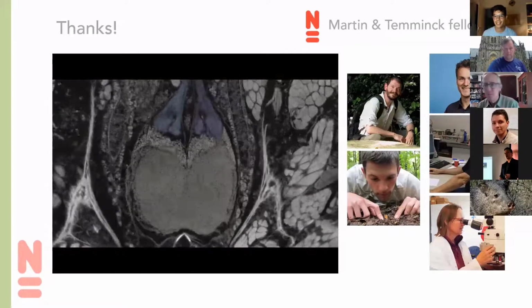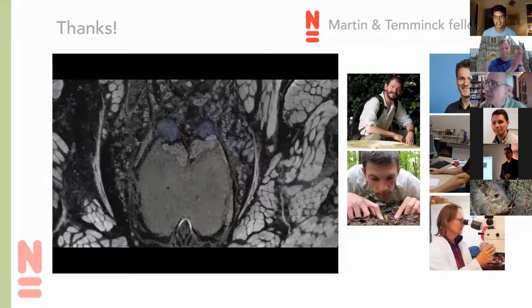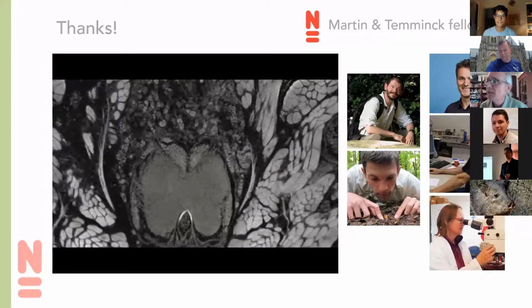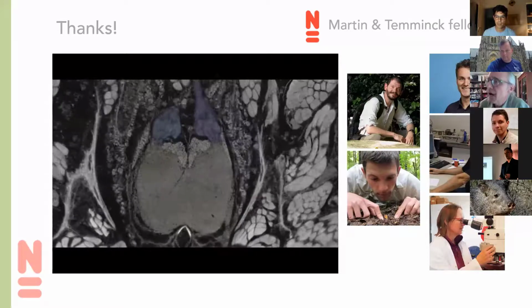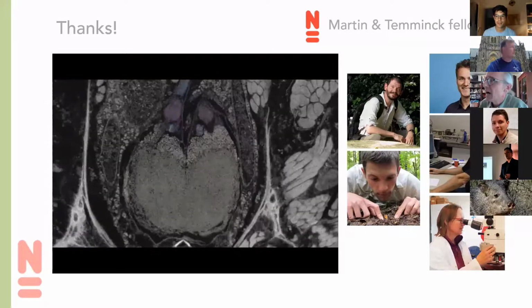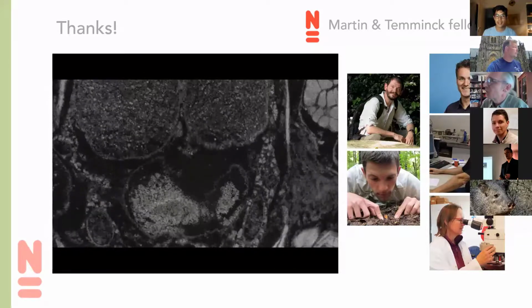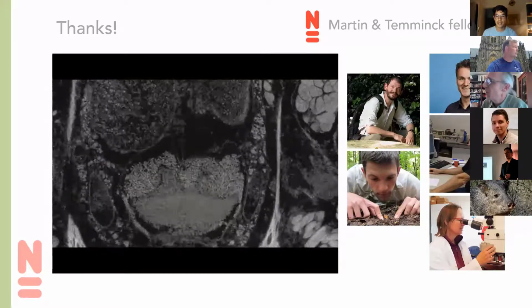Wow, great job. That was amazing visualizations. I do have a little bit of time for questions. Hannah Wood has a question. She says she's surprised that there were problems with iodine. Were you using Lugol solution? Did you wash the specimen for a longish time after staining with iodine?